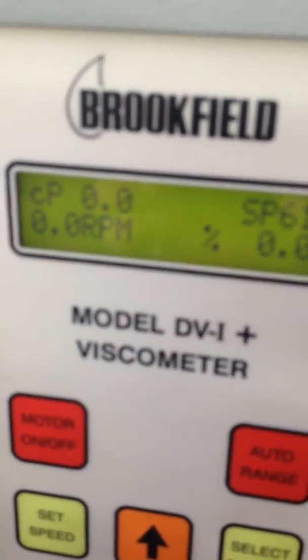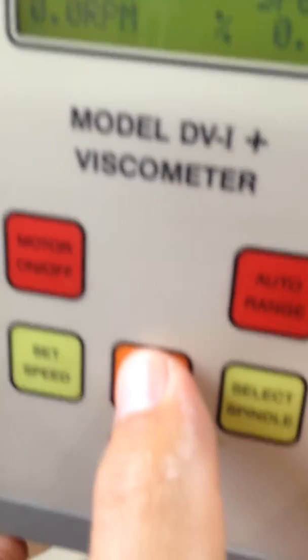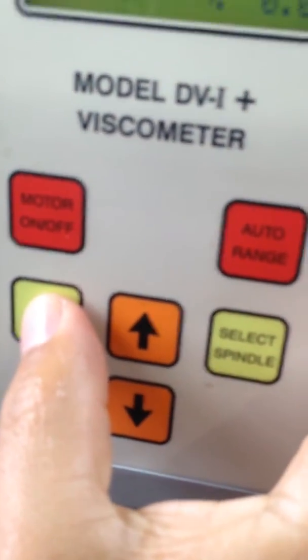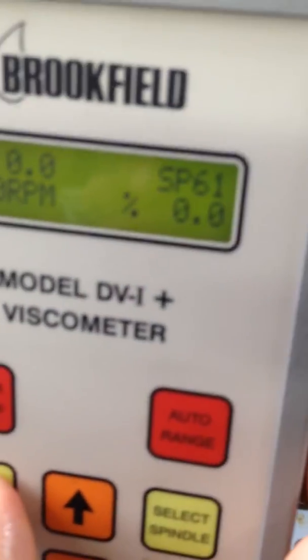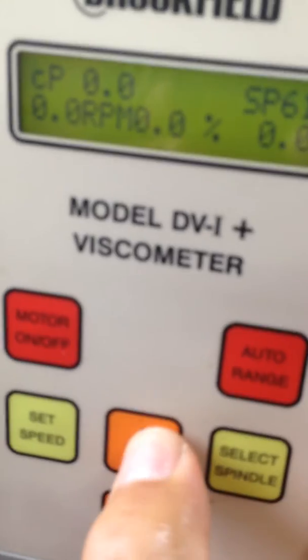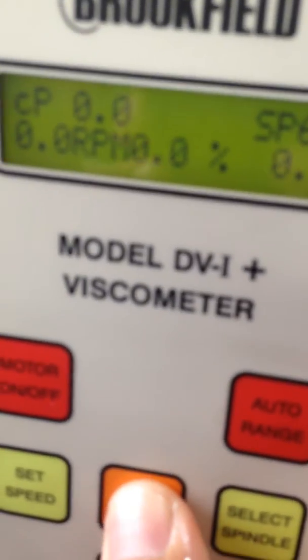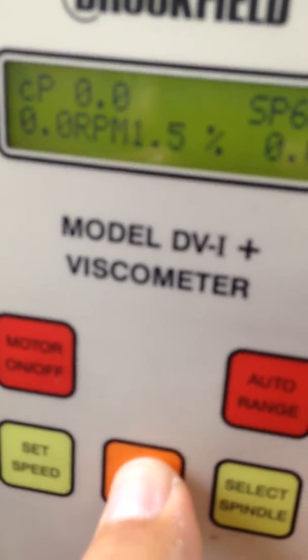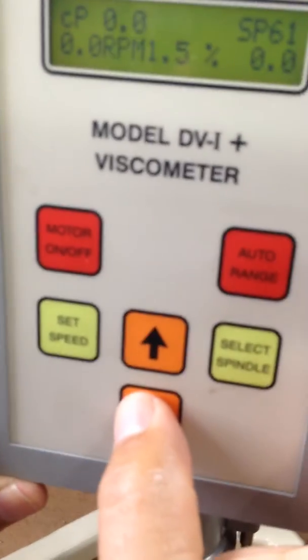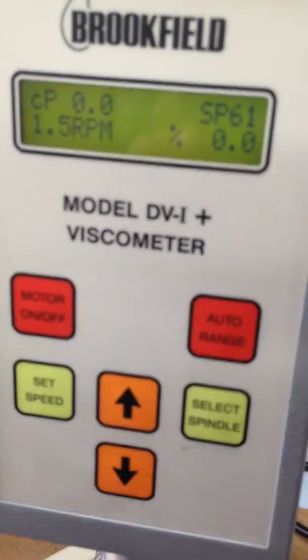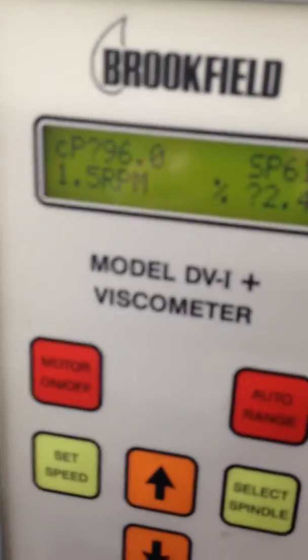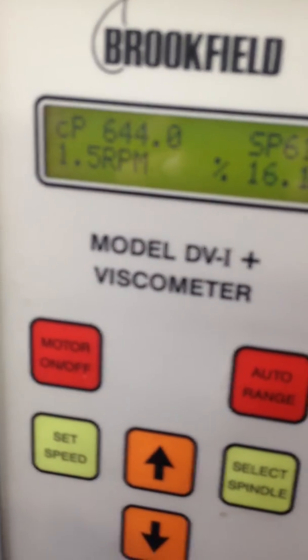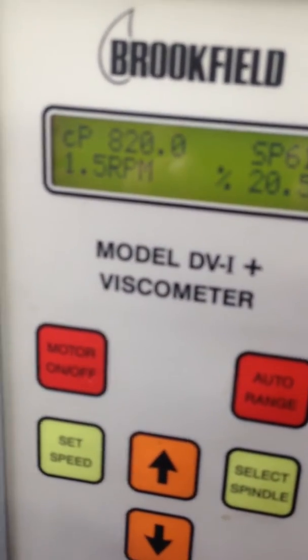For your procedure you want this to be at 1.5. Set spindle, and you're going to be rising this to 1.5, that's your procedure. You say set, so I've pressed set now and that's it, you're done. You let it go.